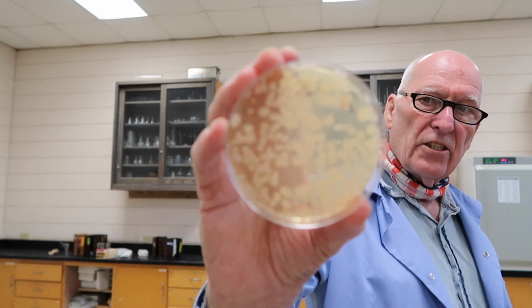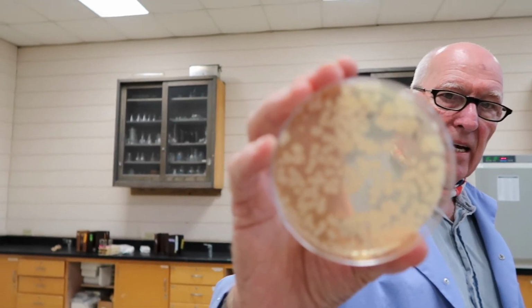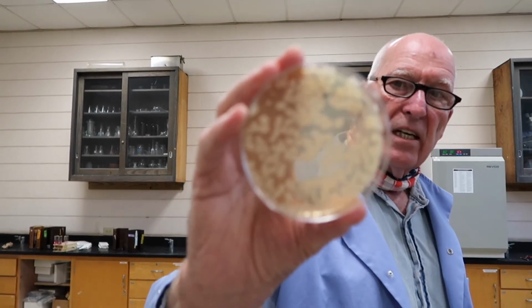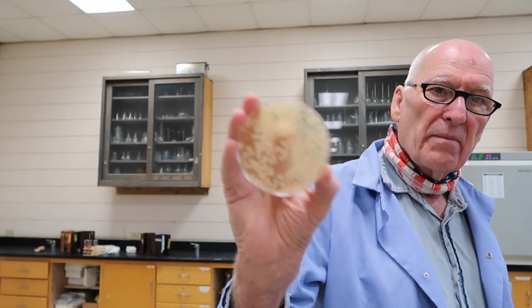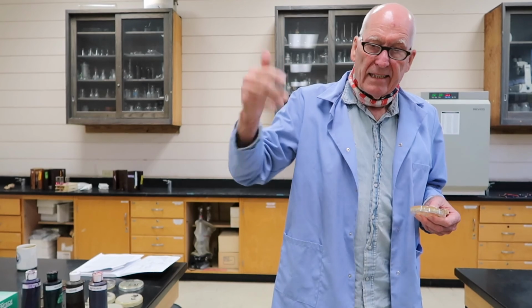All of these colonies you see here at T2, the yeast are still active at 2 days. If we look at the same thing on T4, the yeast are gone. The acid has eliminated them and knocked them out of the picture. So far, all we got in that jug now is going to be your basic lactic acid bacteria.